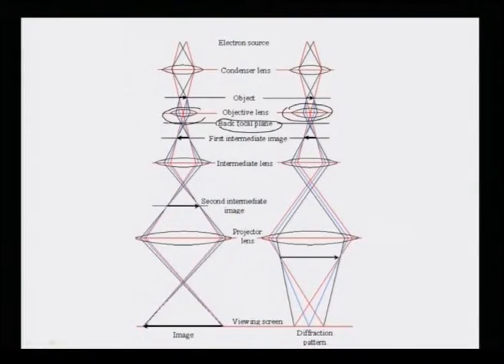And then actually the positions of these focused beams give you diffracted spots, or rather diffraction beams. And when these diffraction beams are focused on, or rather form the image on, the imaging plane, we get a diffraction pattern. Therefore, the back focal plane of the objective lens contains the Fourier transformation of the object, if you think of it that way.